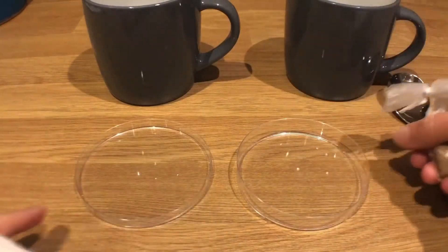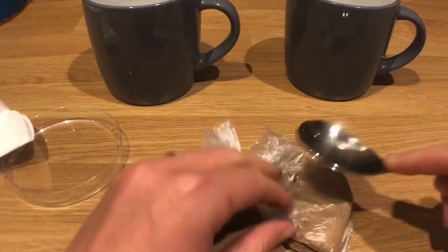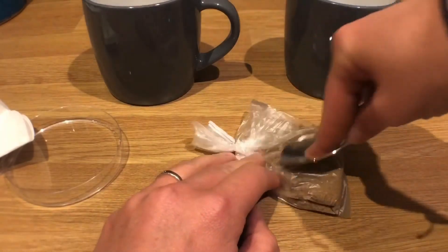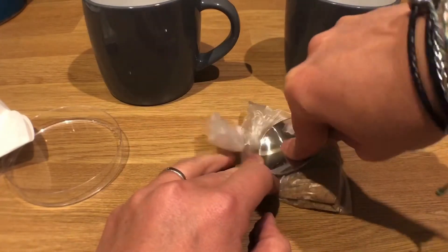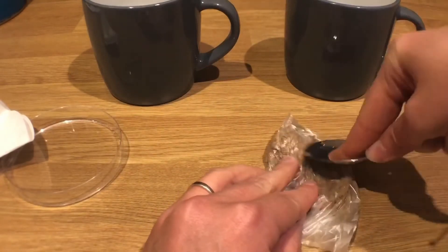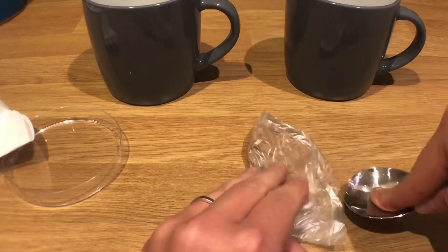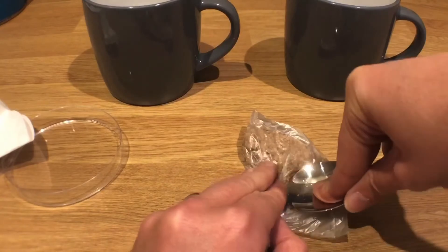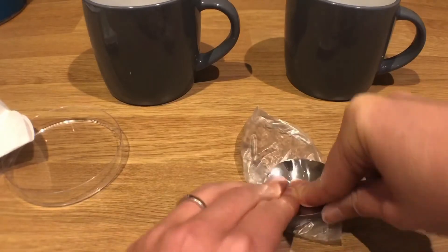The first thing we're going to do is take our rock salt and crush it. You can do that with the back of a spoon or maybe a rolling pin. We're going to crush it as much as we can to try and increase the surface area, which helps the dissolving of the salt in the next stage. If you've got a pestle and mortar, that would be brilliant.